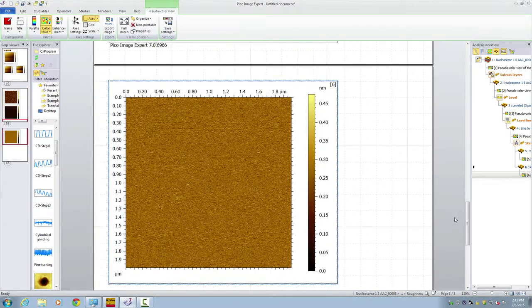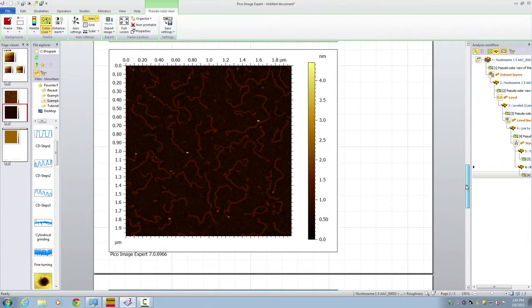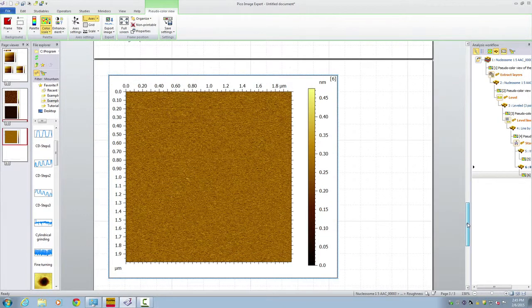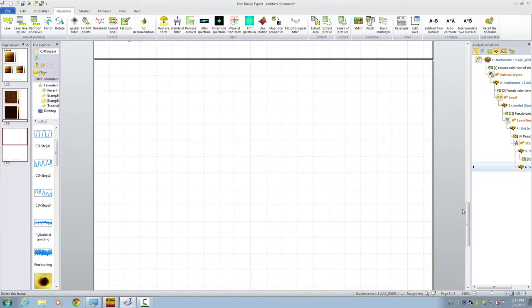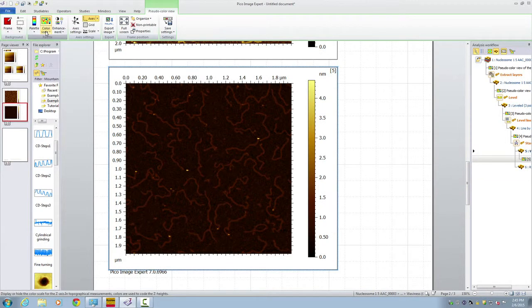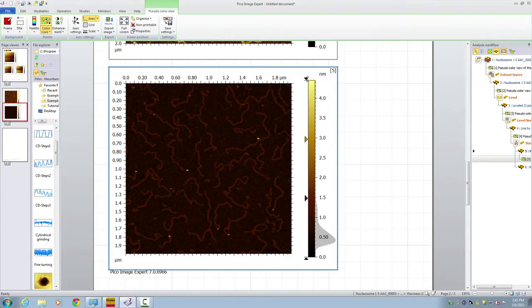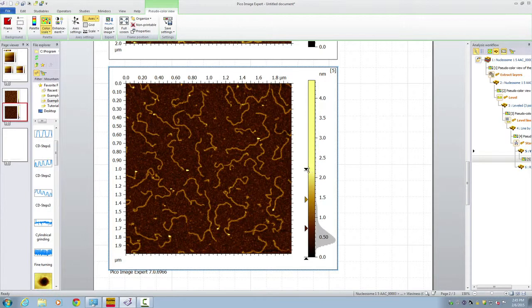This calculation generates two images. One is the low pass and one is the high pass. And we can choose to keep one of the two. Here we want to delete the high pass, which we think is the noise, and only keep the low pass. Again, we could choose to change the color palette, to make it appear to be a better contrast.